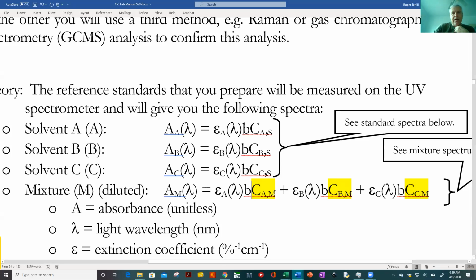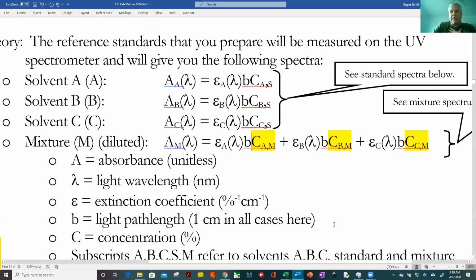So now, if we want to get the concentration of component B, which is toluene in this case, it used to be benzene. Acetone, benzene, and the third component was chloroform. Everything worked, but benzene and chloroform were too toxic, so I scrapped them.